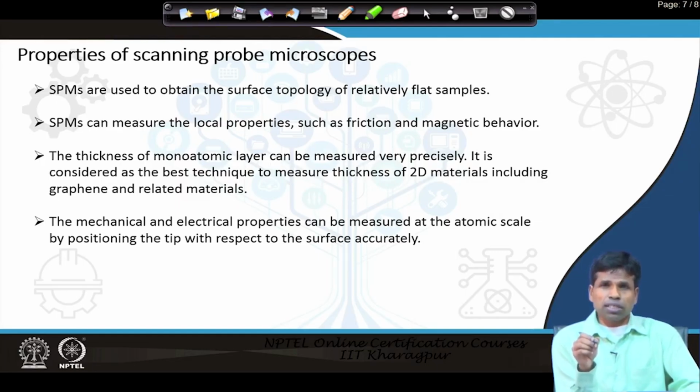First thing. Second thing is that we are going to measure here the information at the atomic level. So, therefore, the sensitivity has to be very high. With that type of sensitivity, we need a finer control, and we cannot do both rough control and finer control simultaneously. Either we can do the rough control of the rough movements or the finer movements. So, thereby it does not allow us to measure very rough samples using this technique.